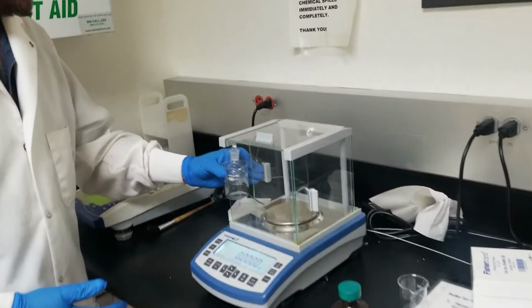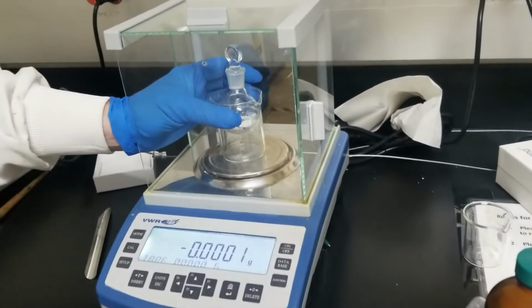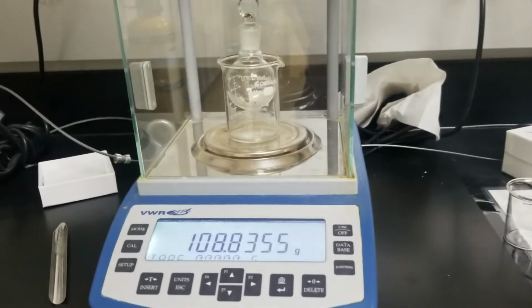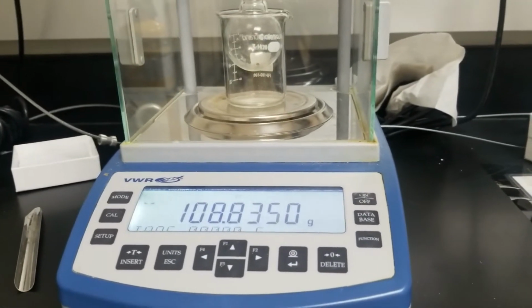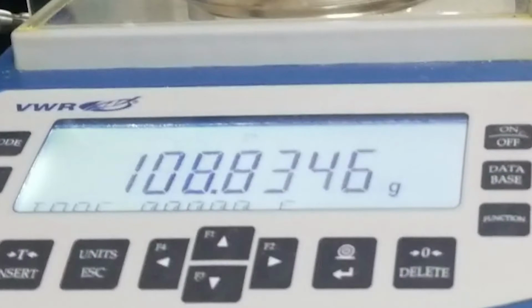So I'm going to put this in here. We don't really have to worry about this being dry because we're going to do an aqueous workup on this. Let's see if that'll settle down. A little symbol appears here when it's done. Okay, when it settles out. There it is. So we got that. Let's take that as our tare weight.